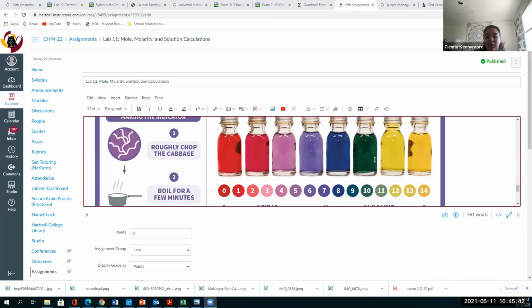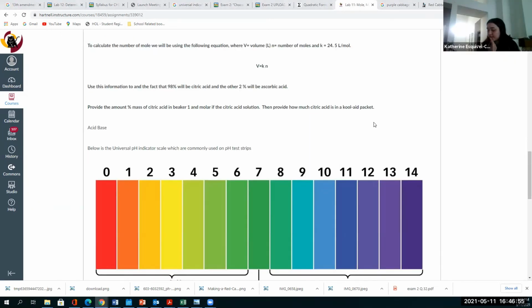Yeah, let me see. Should I re-upload? So for the second, the first 2 tries, I've gotten 35. Should I do it one more time? No, the first 2 tries? Yeah, the first 2 tries have been 35. That's perfect. Do it one more time, and then you have your 3 data points. Good. Okay. Dr. Henry. Yep.